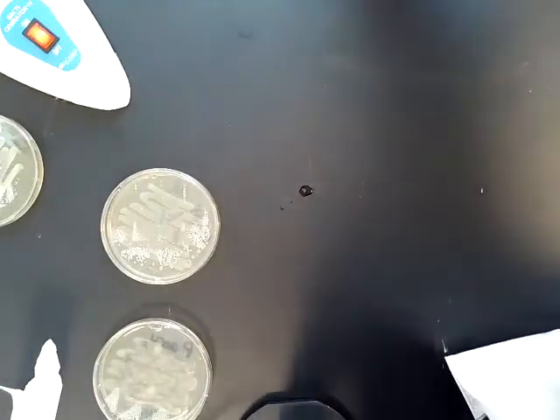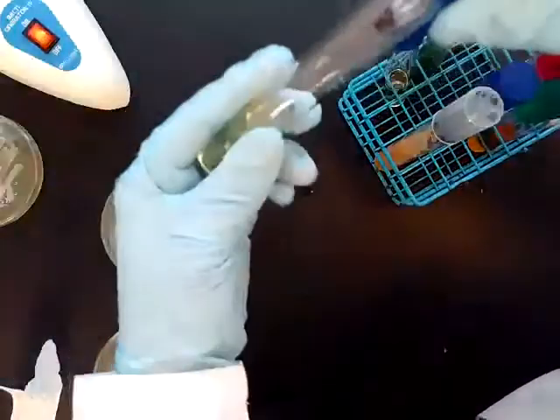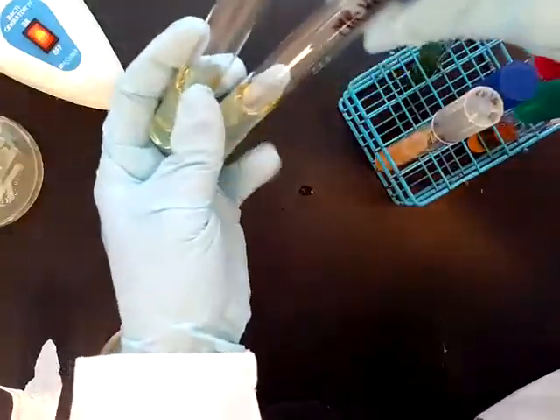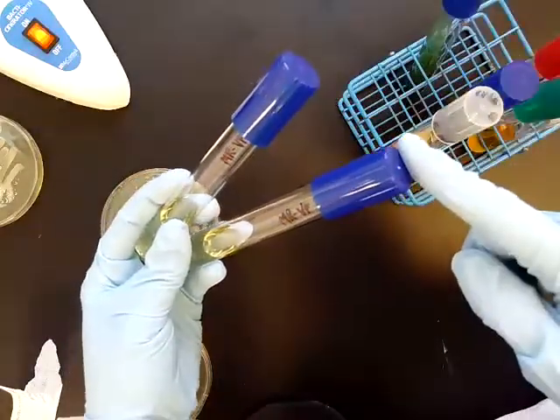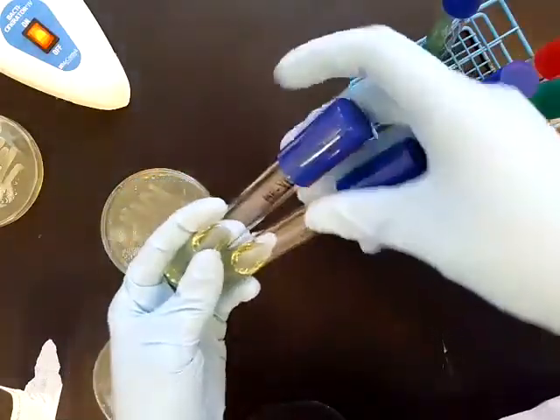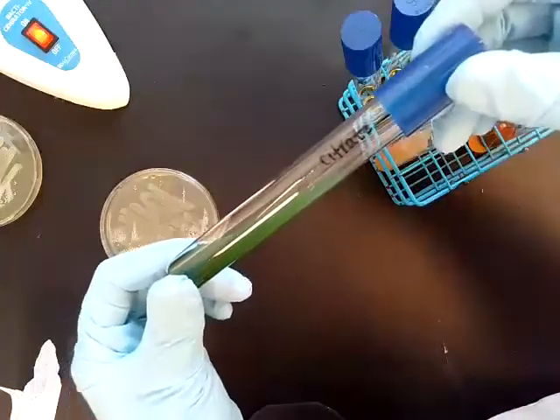The next tests just involve tubes. So we have the MRVP broth. We're going to inoculate 2. One of them is going to be for the methyl red test. The other one's going to be for the Voges-Proskauer test. And then we have the citrate slant. And this is what the citrate slant looks like.